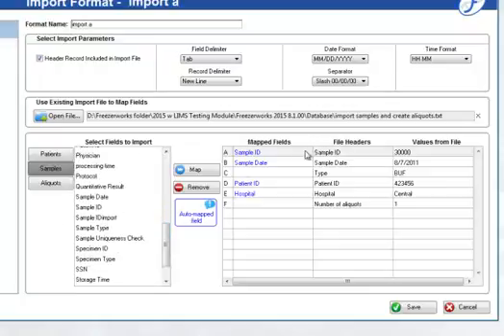Here's the one that it found the match, but I want to actually import sample ID from Excel and into sample ID import. So I highlight that, I highlight this, and I select map, and now it's going to map the sample ID into the sample ID import. The next field was sample date. It found an exact match again, sample date. Here it is here. That's good. That's where I want to import it, so I leave that.